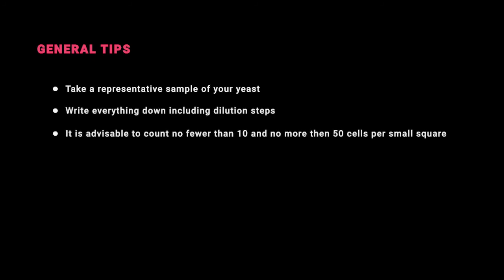Take a representative sample of your yeast. Write everything down including dilution steps. It is advisable to count no fewer than 10 and no more than 50 cells per square. Get a manual clicker to reduce the chance of miscounts. Get at least two if you're doing viability as well.